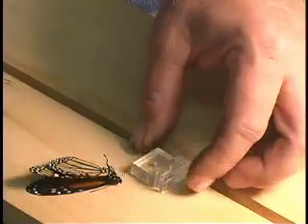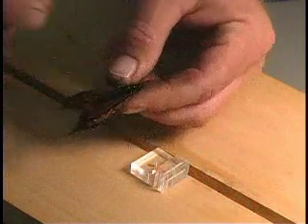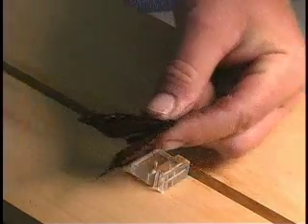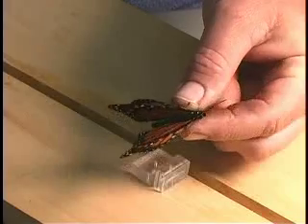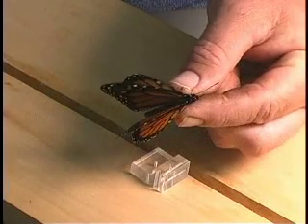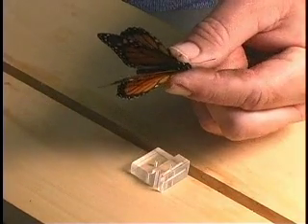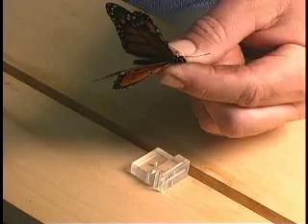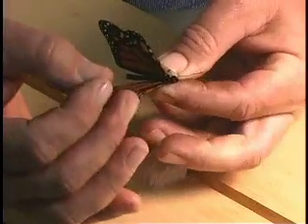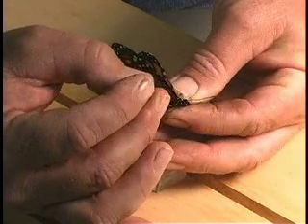So first thing you do is you pick up the insect on the sides of the thorax, and on Lepidoptera, if they are recently collected, their wings will be fairly limp. If you gently squeeze the sides of the thorax, you can see the wings will start to open. That will allow you to come in with the pin and insert into the center of the thorax.